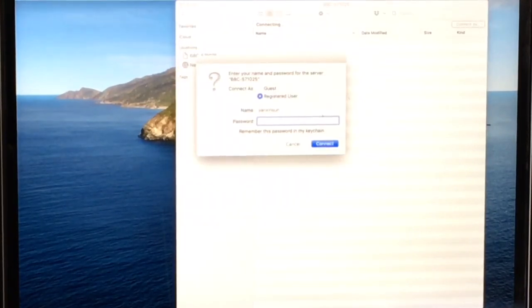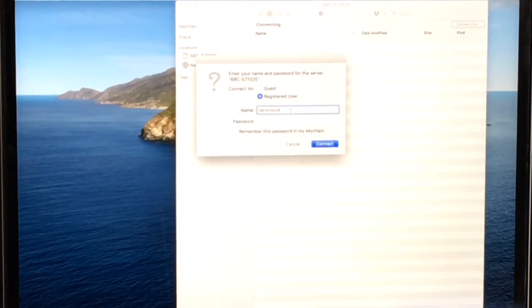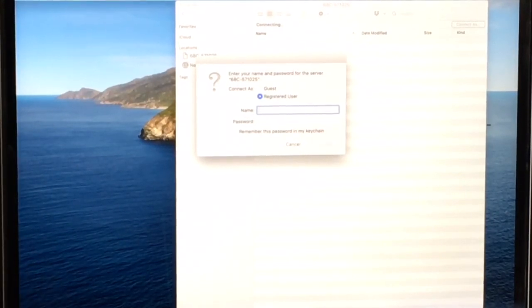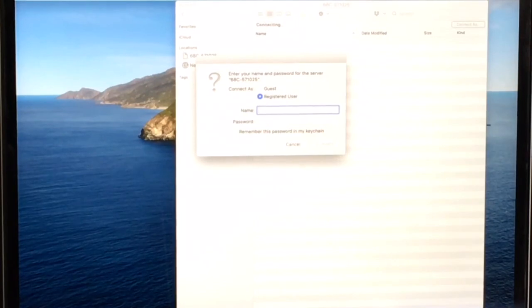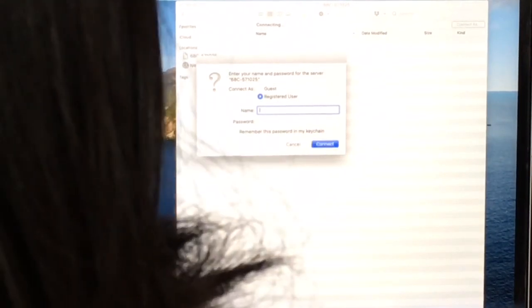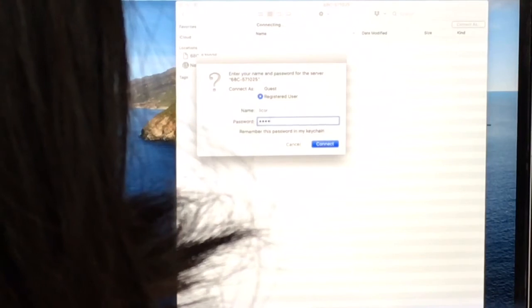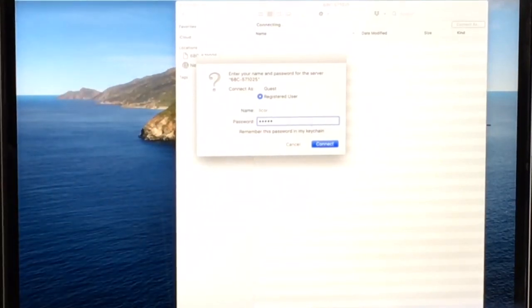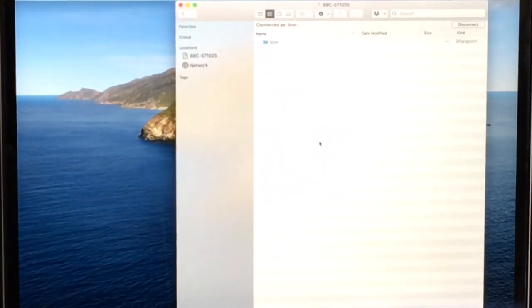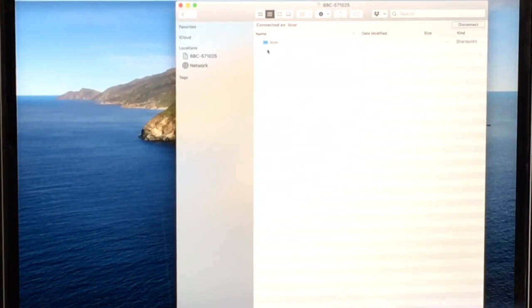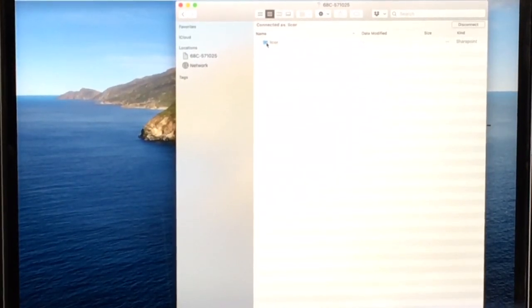When this window pops up, just enter the name and password, which are both LICOR, lowercase, no space, no symbols, and then connect. You will see the LICOR folder shows up. Double-click this folder.